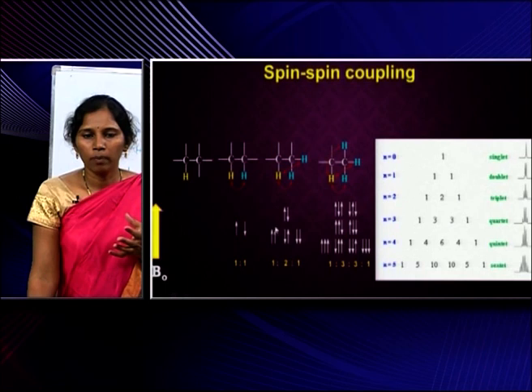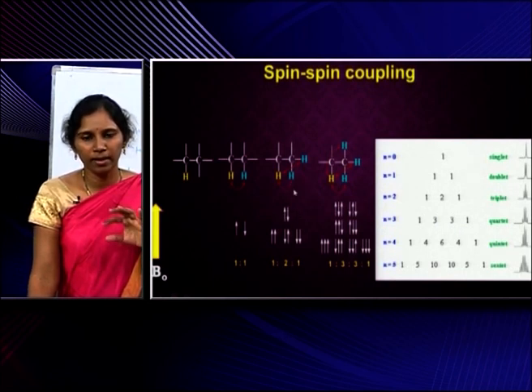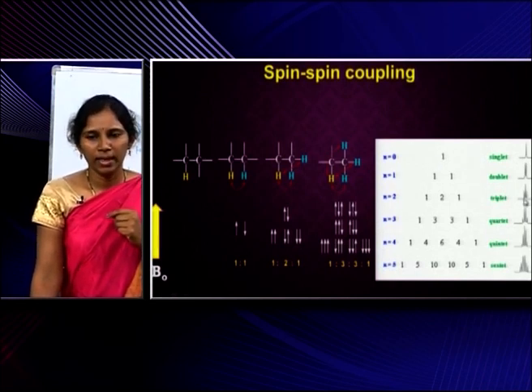If these 2 are in the same direction, B naught having 30 and B naught is having 30, here 2, 32. Here no resultant, because one spin cancelled with the other for these 2 hydrogens, and hence in this case here 30 only. And if you take this one, because of opposite direction, 1, 1, 2, 30 minus 2, 28. Like that, 3 different field strengths will be observed by B naught, producing 3 signals in NMR spectrum.